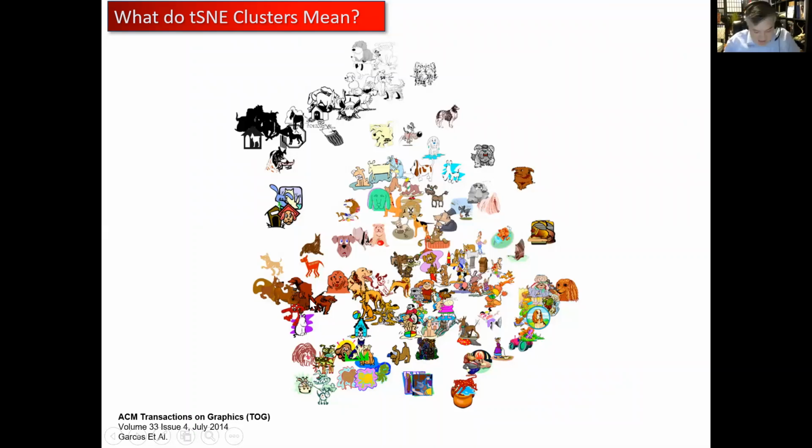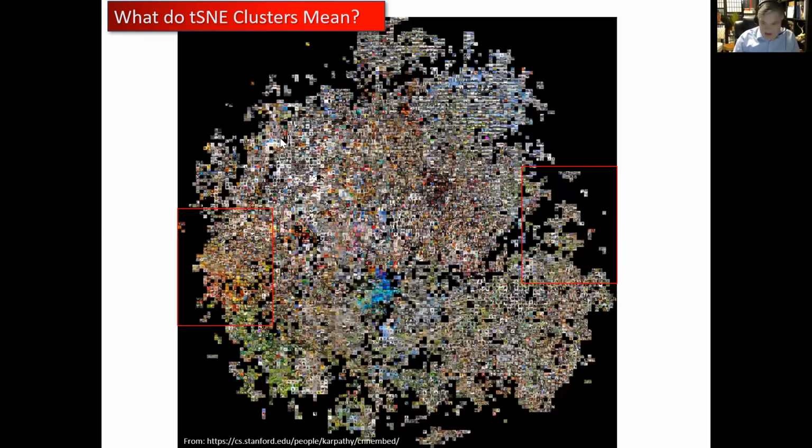And the same thing goes when we work with flow cytometry data, is that you have to look at this data and you have to assign it some sort of phenotype. The algorithm itself isn't some sort of magic bullet that's going to come in and say, all right, this is the phenotype and it's called white dogs, right? It's just going to put clusters and pieces of information in some sort of way that you can distill it and try and label it. And you can take this in a more extreme example. I found this image on the web here from, it looks like some folks at Stanford who were clustering a bunch of images from the internet.